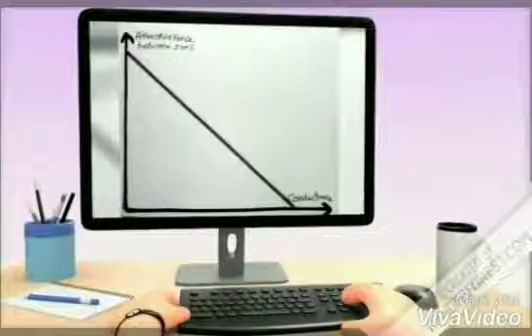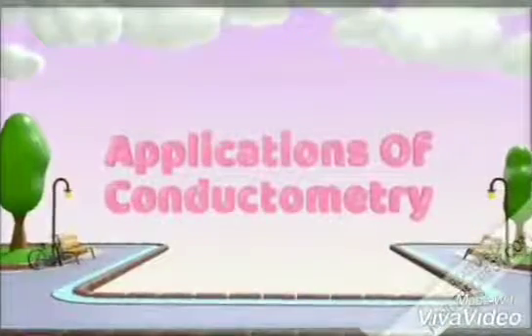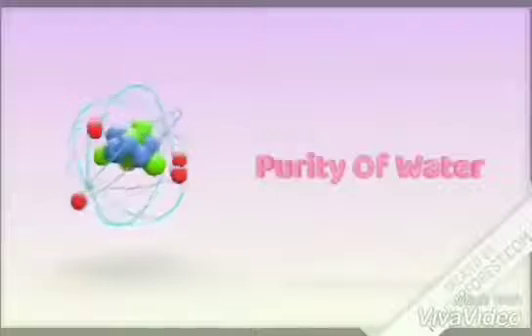Application of conductometry: the purity of water. Distilled water is almost pure and has a very low conductance, but tap water contains ions and so conductance is high. Now we are going to talk about conductometric titration and their curves.